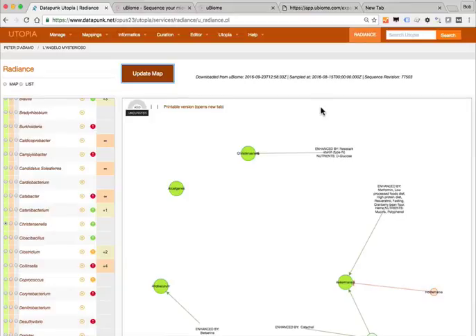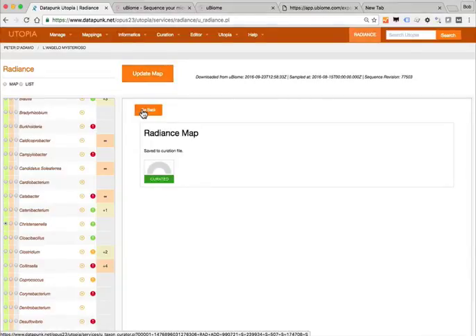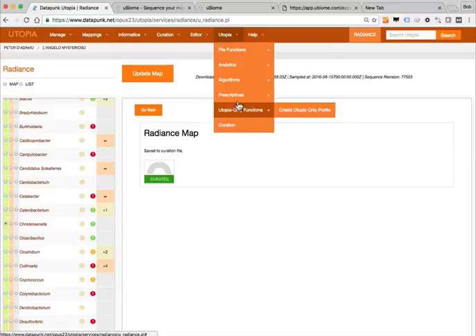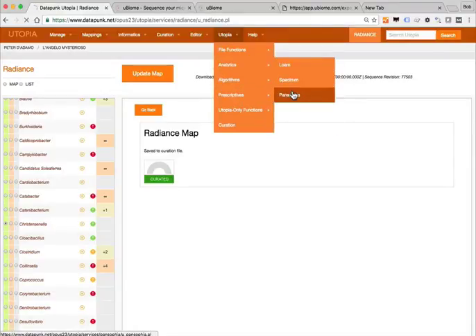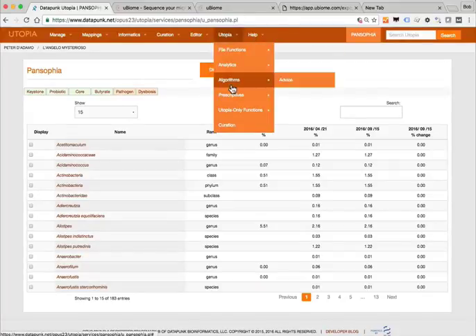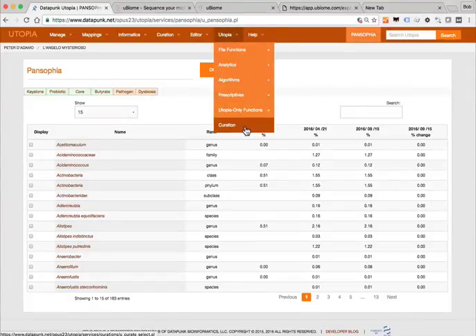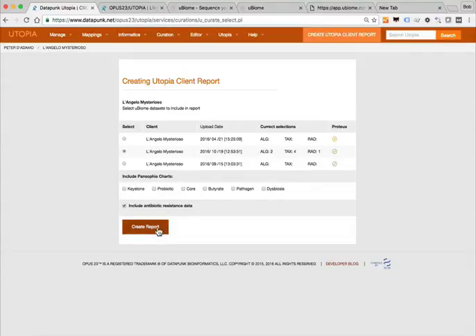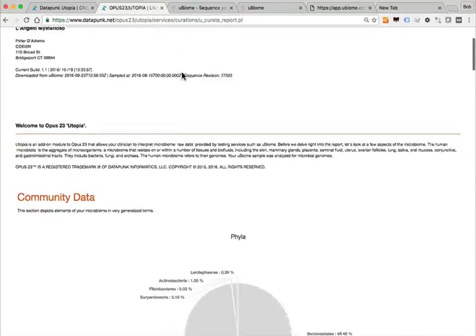There's obviously a lot more that you can do with this. Let's curate this and save that. You'll notice as soon as you curate something, at the bottom it says Curation — basically it's saying you probably want to make a report. You have to select which particular uBiome result you're going to base your report on. We're working with this one so we'll select that. You can include Pansophia data or you can print it out from the screen. We hit the button and in a different tab is the report data.